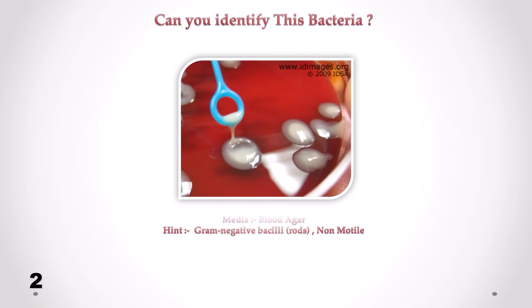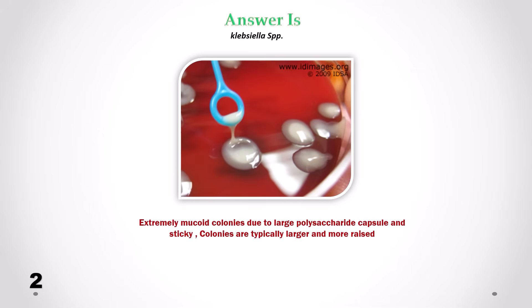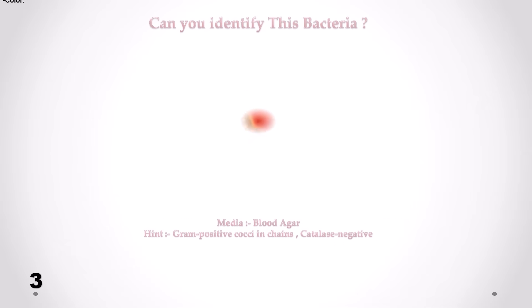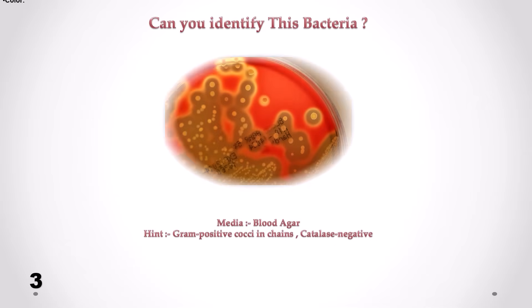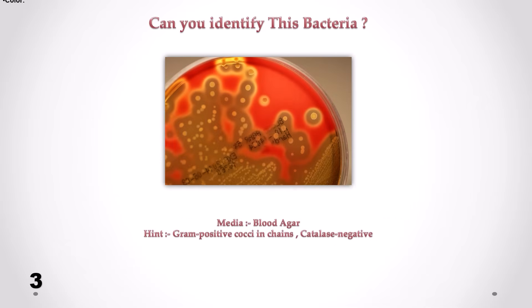Can you identify this bacteria? Correct answer is Klebsiella. We can see extremely mucoid colonies due to large polysaccharide capsule, and sticky colonies are typically larger and more raised.